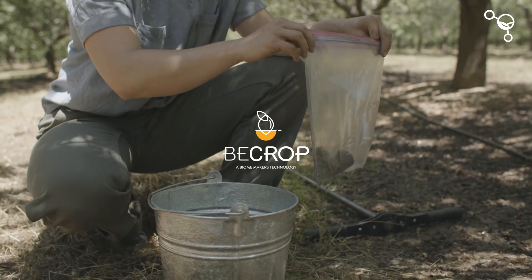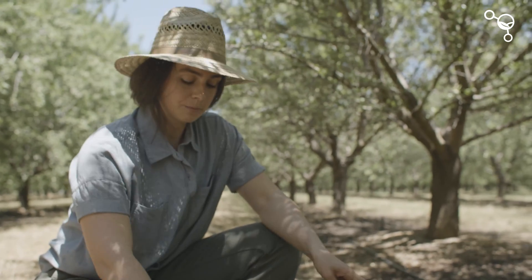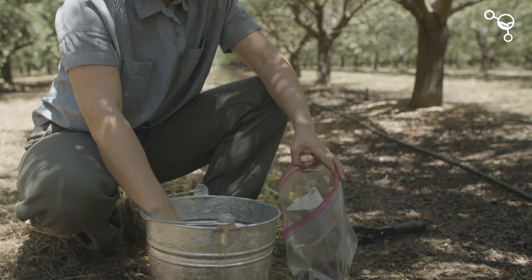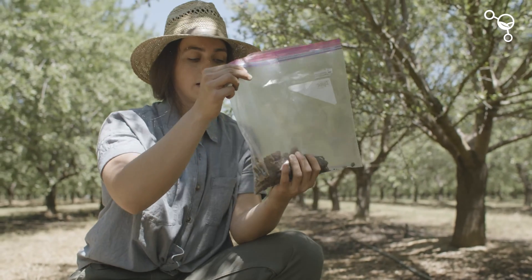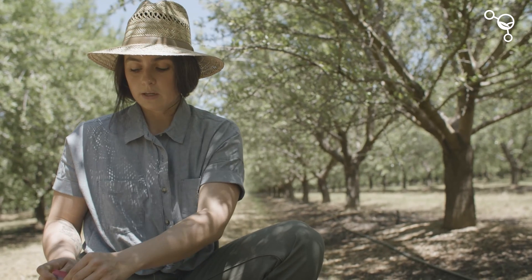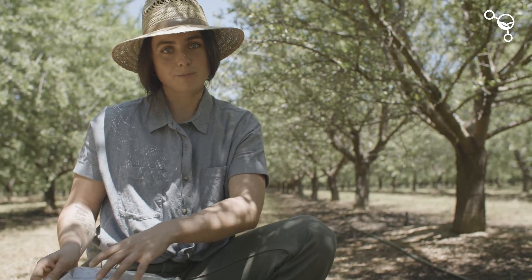If you're collecting a B Crop Plus sample where you want fertility and the biology portion, then we'll add a little bit more soil — we need enough to run the chemical analysis and the biological analysis. Now we've got our subsample of the composite. We're going to seal this up and take it back to the truck to subsample it with our sampling tubes before shipping.